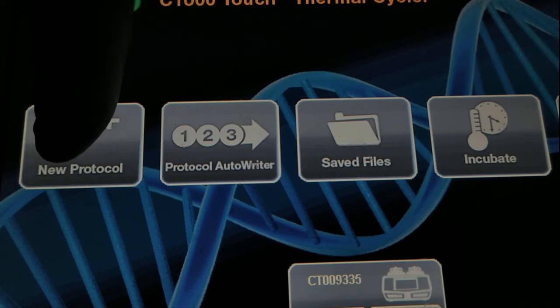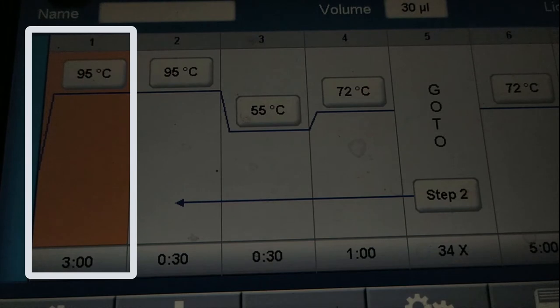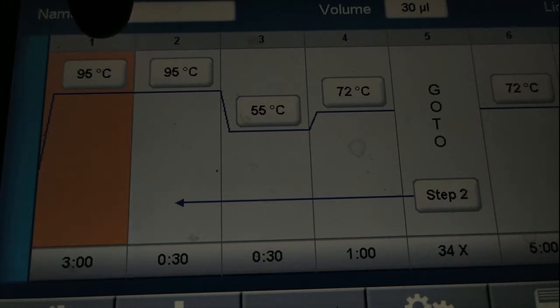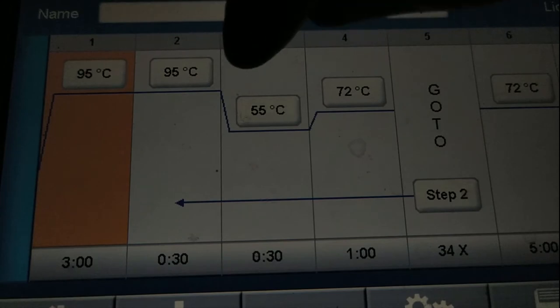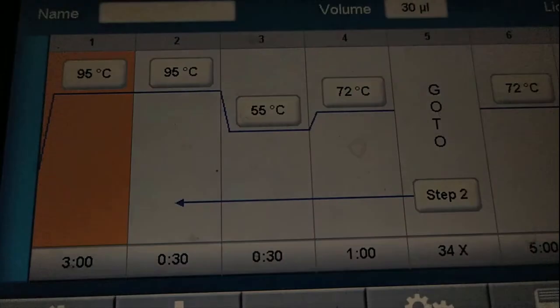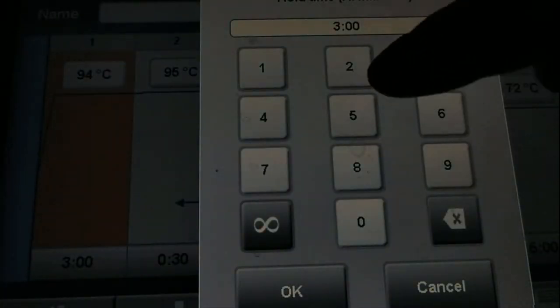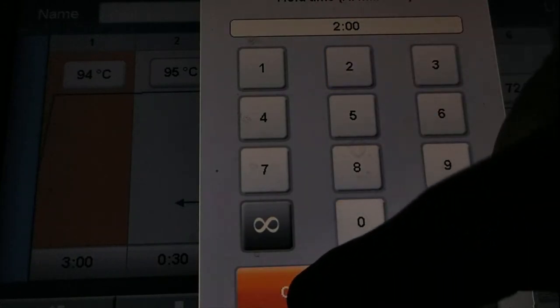In our case we are going to start a new protocol. And here we have the first column saying the initial denaturation at temperature 95 degrees Celsius for 3 minutes. Now we need to change it to 94 Celsius degrees and 2 minutes. So to do so you just press on the 95 and set 94. Then press OK. Press on the time and change it to 2 minutes. Then press OK.